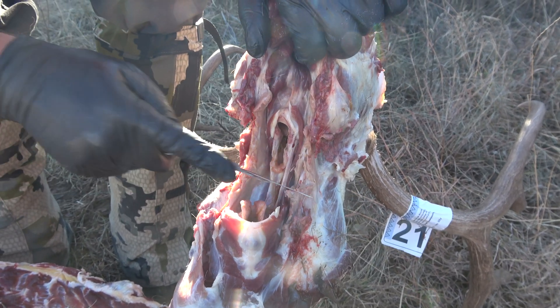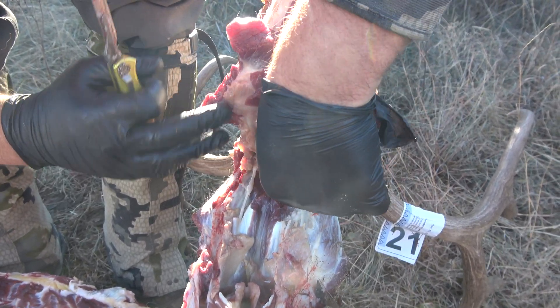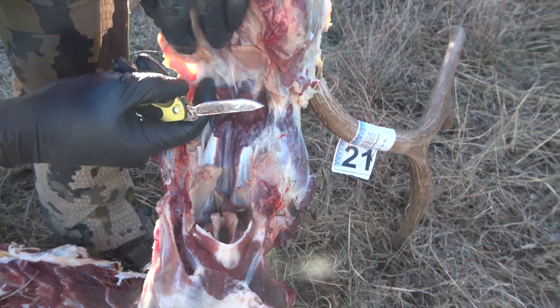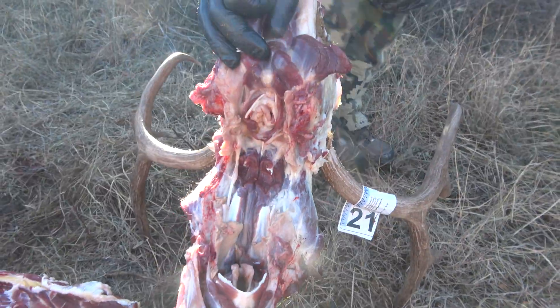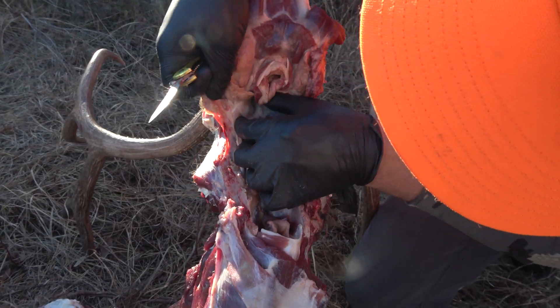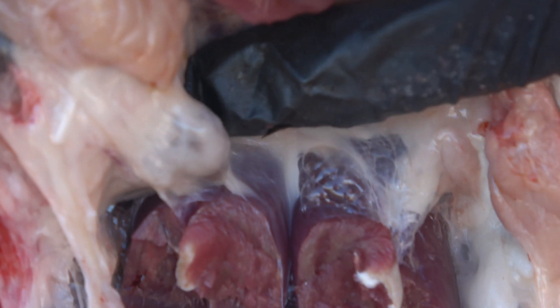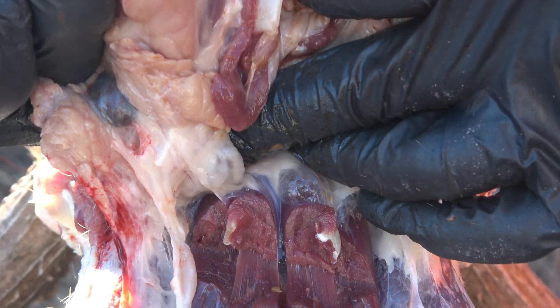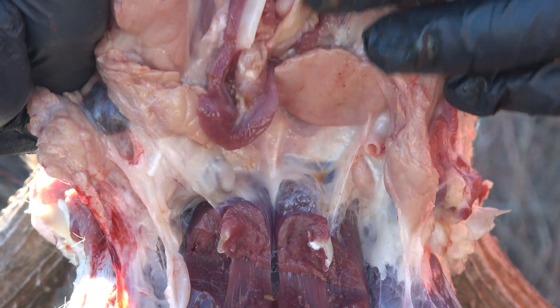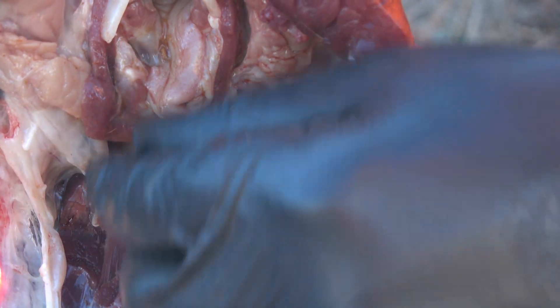Cut down until it comes away like that, and then you can find the lymph nodes. Let me get on this side so you can see — there's one right there. It's a little darker than the fatty tissue, and you can tell it's underneath a little layer of skin.